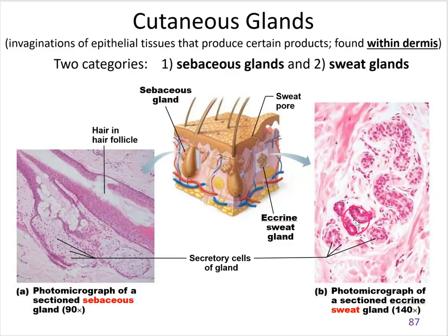And then over here we have sweat glands, and these are easier to find. And what you're seeing is epithelial tissue, because glands like this are made of epithelial tissue. Looks like maybe simple cuboidal tissue. Maybe stratified cuboidal, but I think it's simple. I think this is simple cuboidal. And in some places, the random twists are in the plane we can see, and other places they aren't. So we just see a lot of these circles.